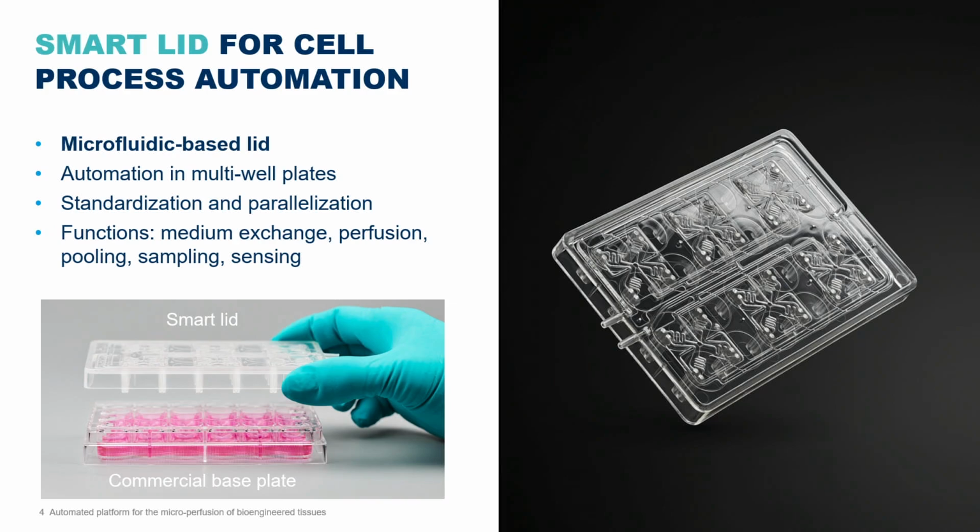The principle is to rely on a commercial base plate, which could be a normal base plate or also a specialized base plate with a multi-well plate format. And we bring fluidic function onto the lid with microfluidic channels in the lid to bring liquid into the wells and from the well, therefore enabling automation of cell culture processes.